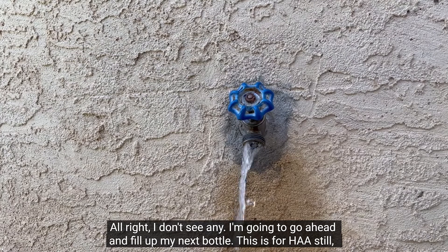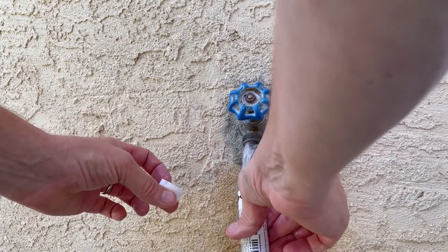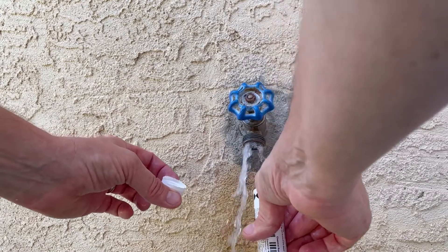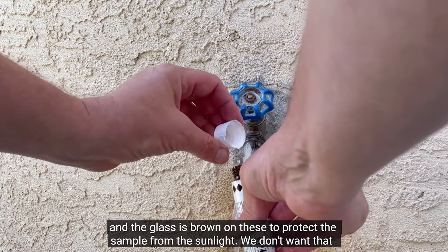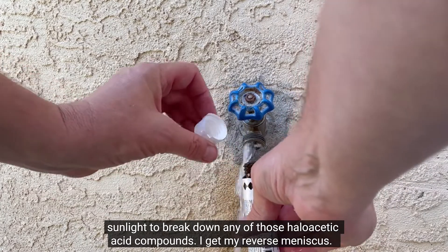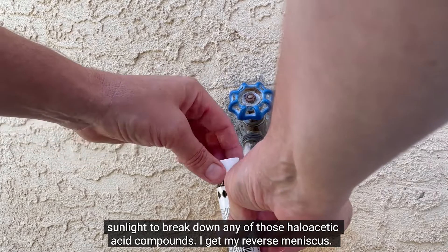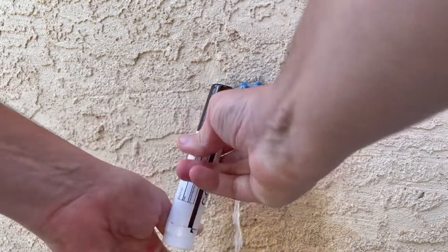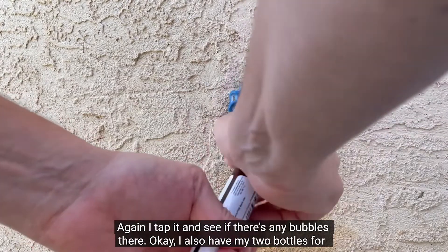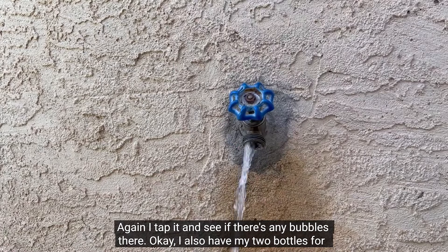I'm going to go ahead and fill up my next bottle — this is for HAAs still. The glass is brown on these to protect the sample from sunlight. We don't want that sunlight to break down any of those haloacetic acid compounds. I get my reverse meniscus, then tap it to see if there are any bubbles.